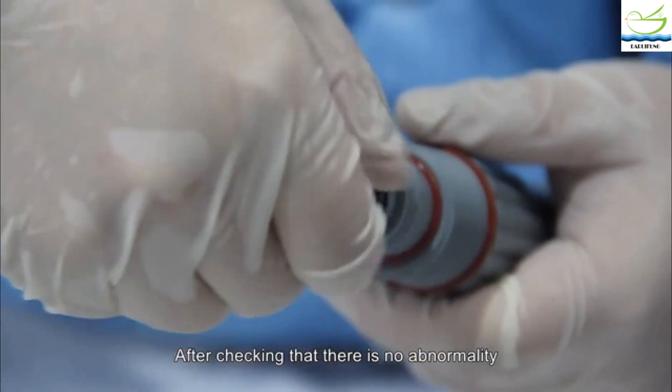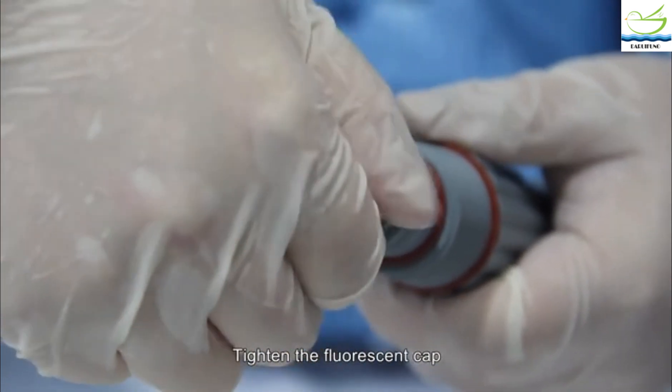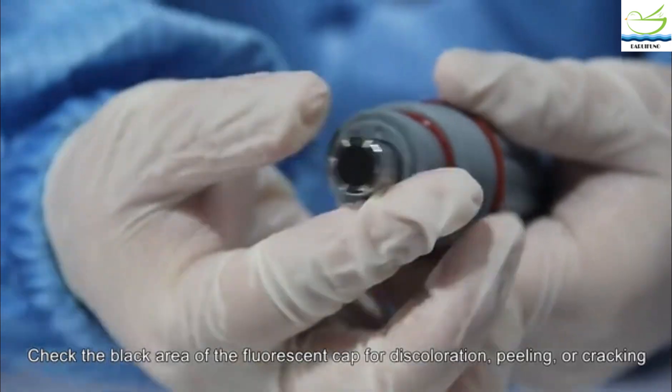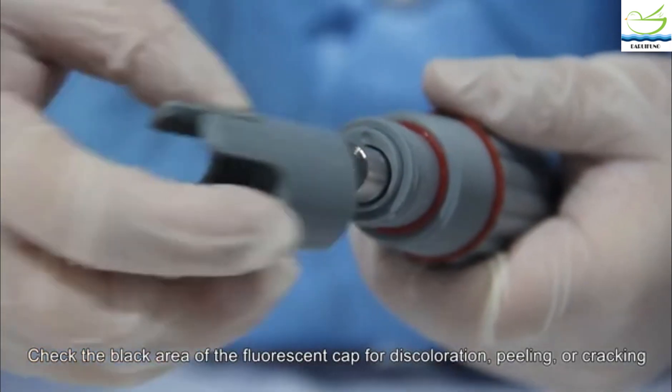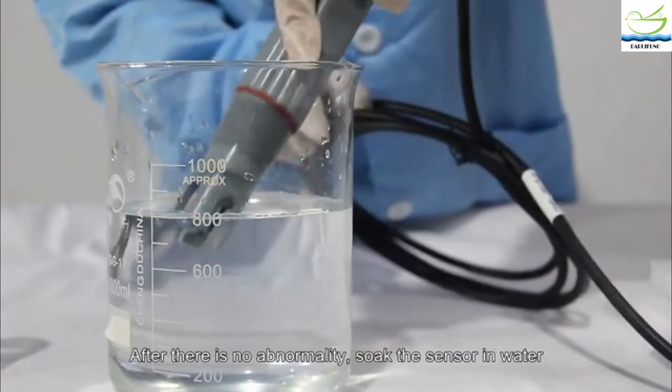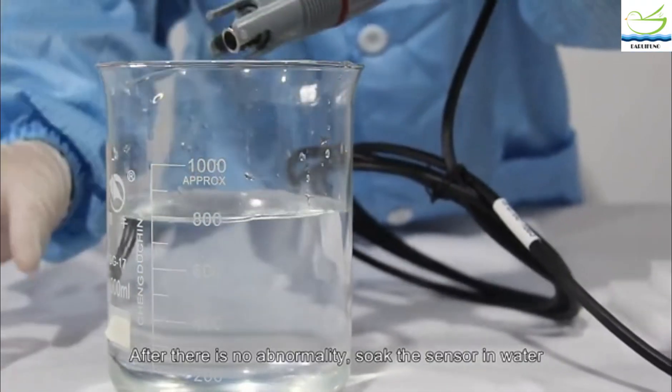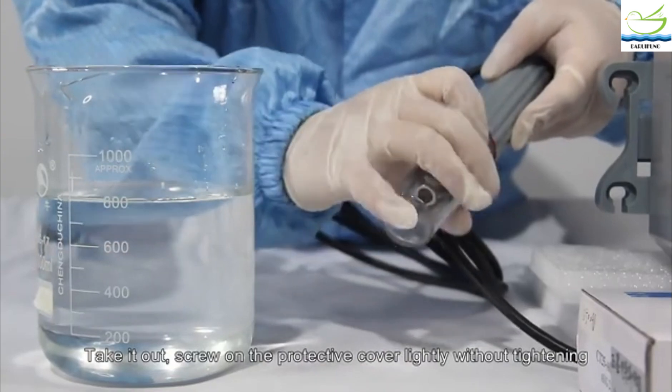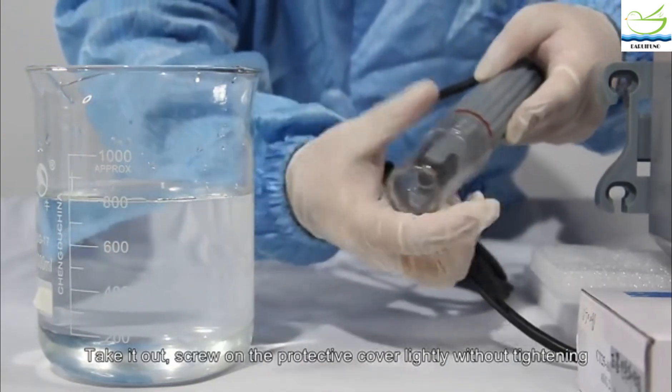After checking that there is no abnormality, tighten the fluorescent cap. Check the black area of the fluorescent cap for discoloration, peeling, or cracking. After there is no abnormality, soak the sensor in water, take it out, and screw on the protective cover lightly without tightening.